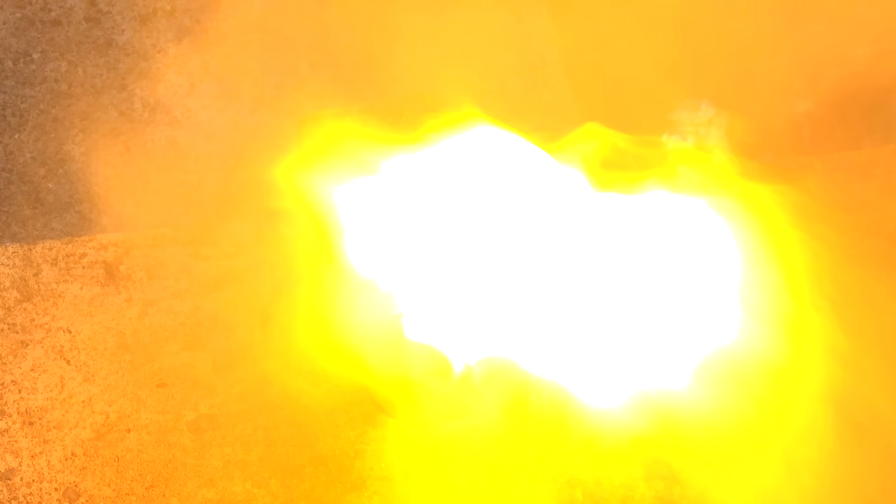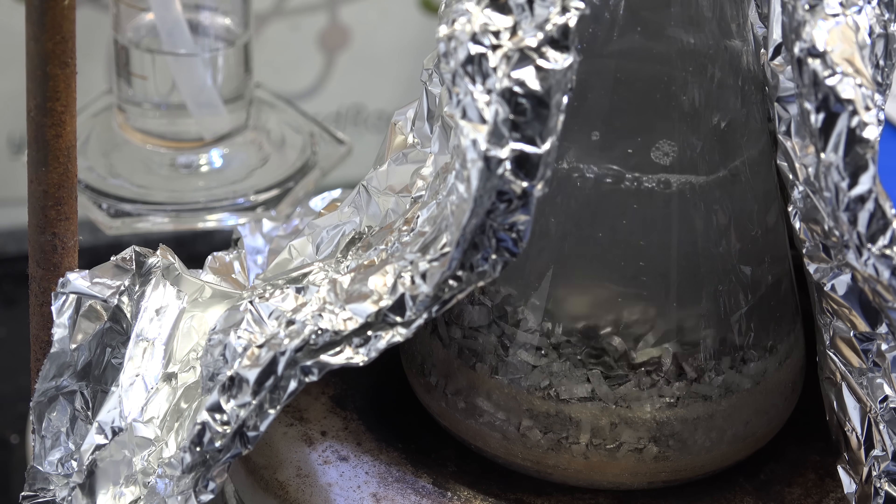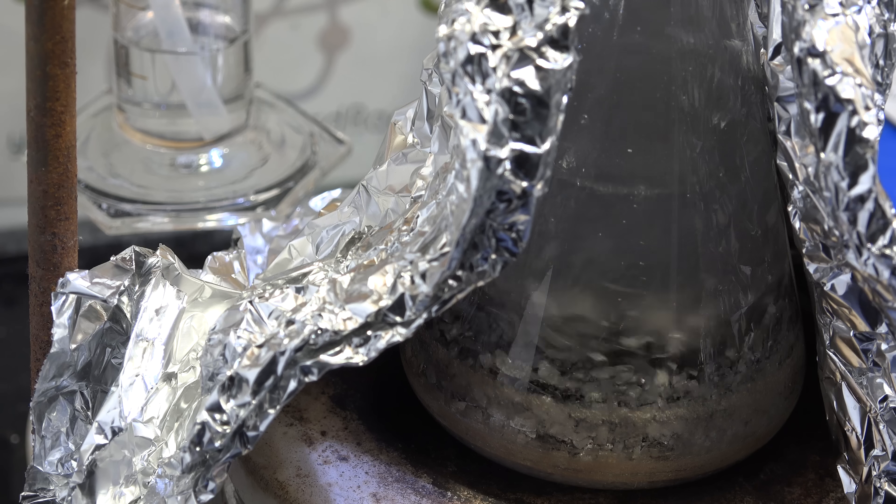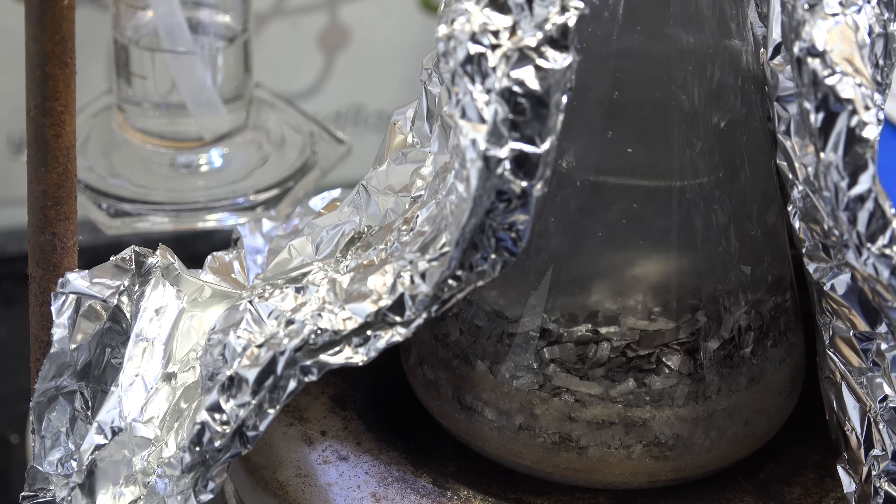But for now I'll keep using glass. Glass lets you see what's going on and easily lets you stir the mixture by magnetic stirring. So I'm going to need to figure out a way to protect glass.